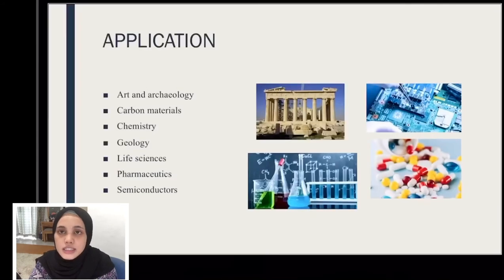Okay, there are some applications involved in Raman spectroscopy. First is art and archaeology, carbon materials, chemistry, geology, life sciences, pharmaceutics, and semiconductors.